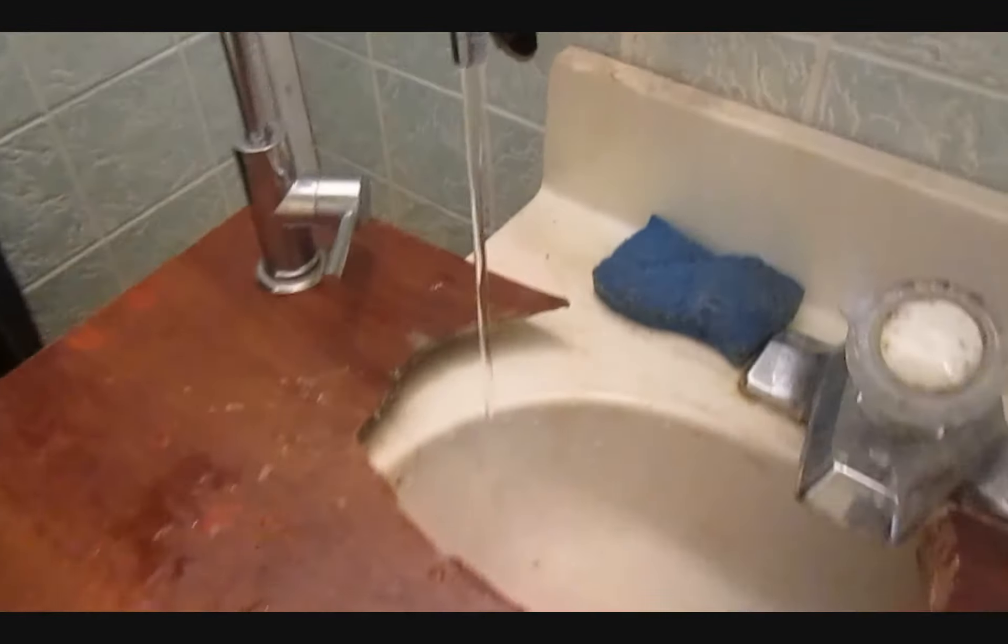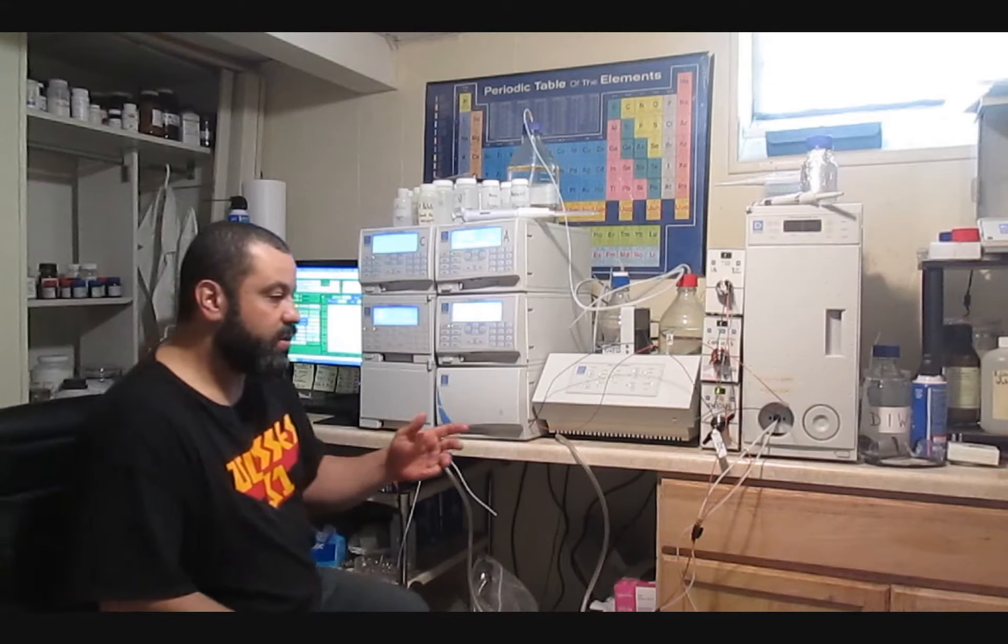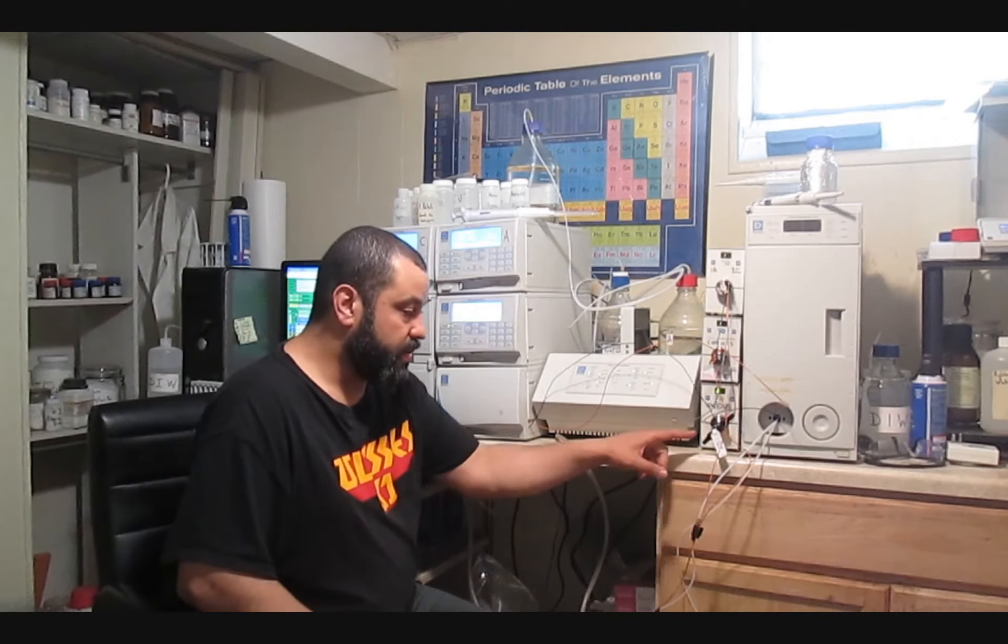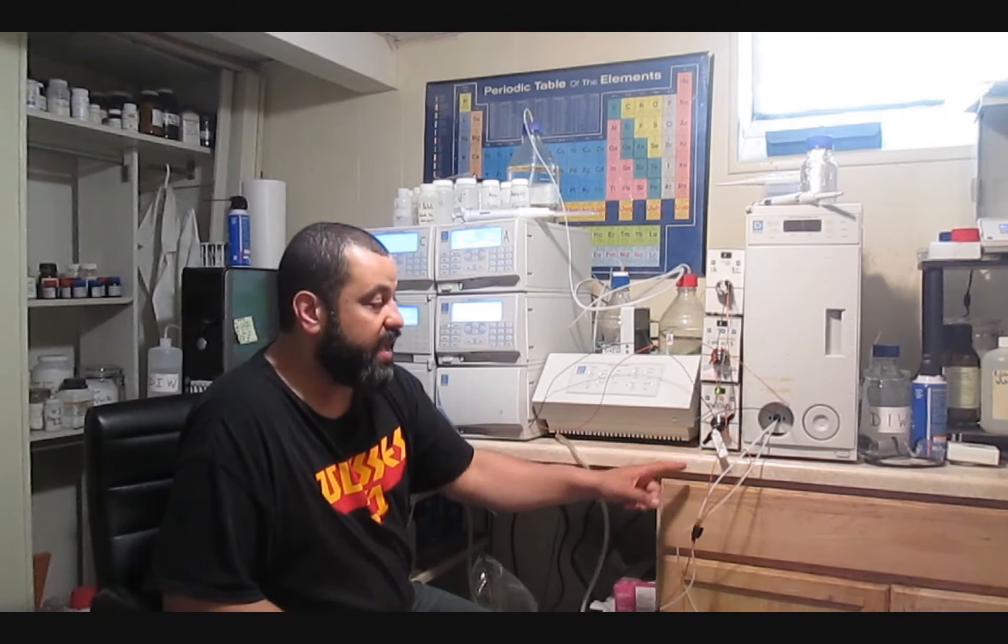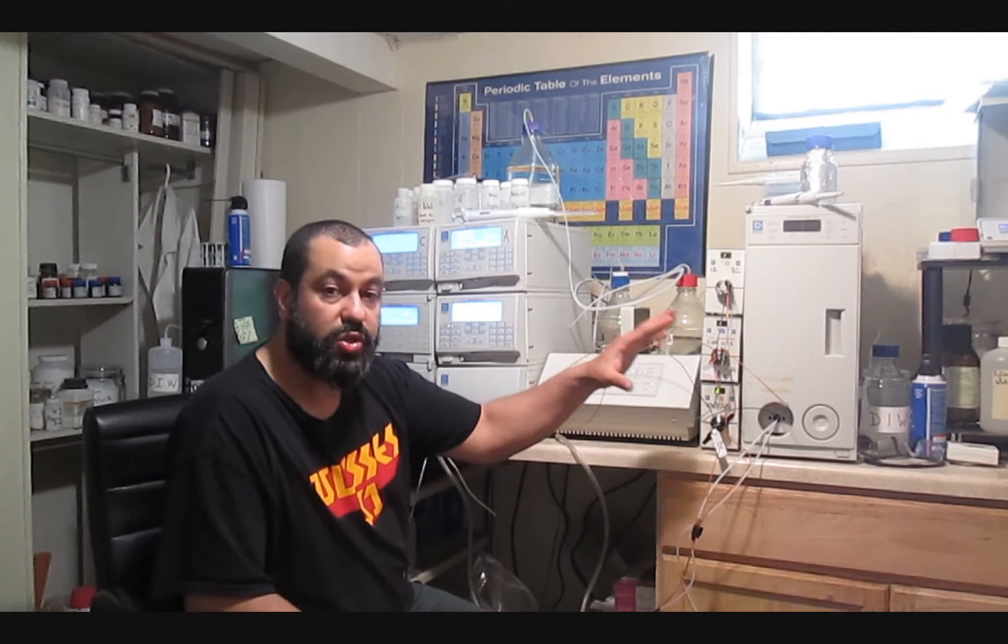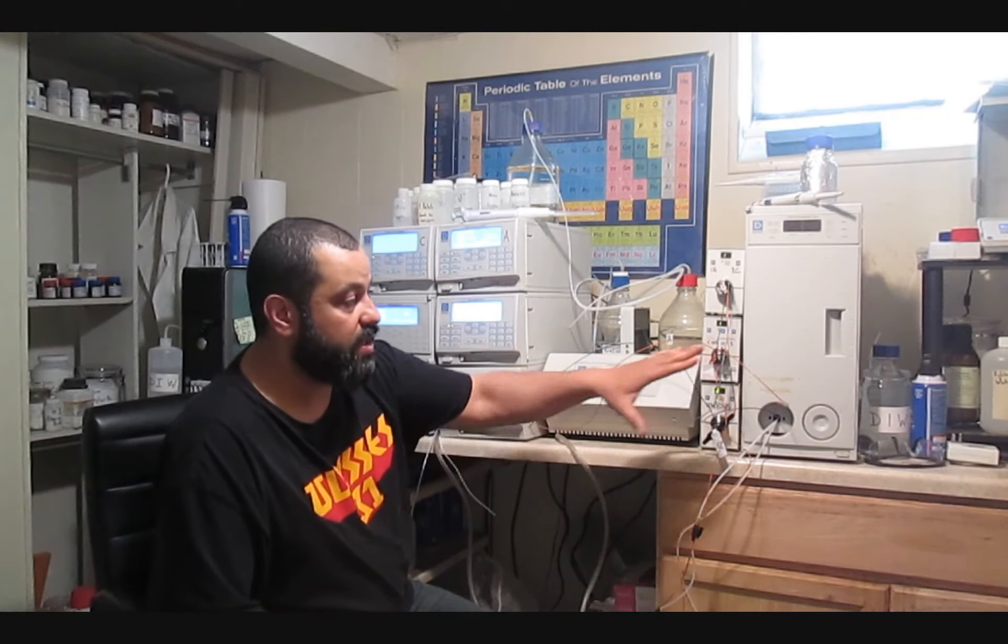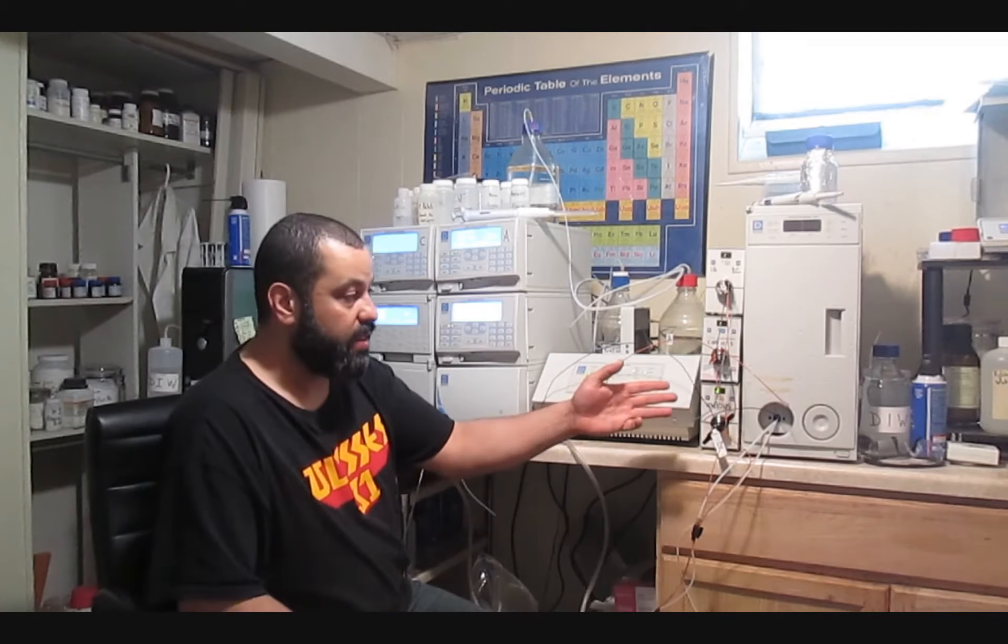And by doing this, I'm able to verify the purity of my DI water system. So as I just described, the concentrator here, which is nothing more than the guard column in place of the sample loop, allows the sample to be concentrated so we can get to a much lower level of detection in the column here. And we can now take down to PPB level.